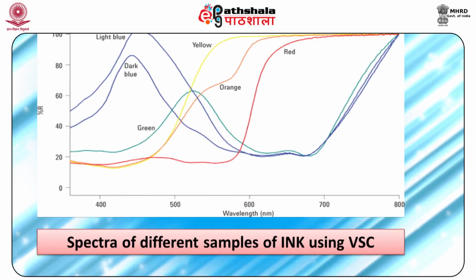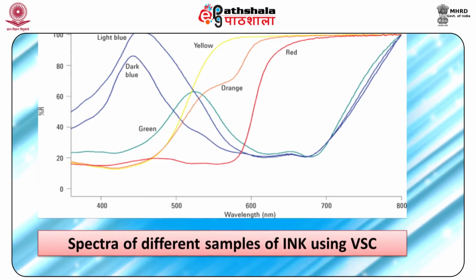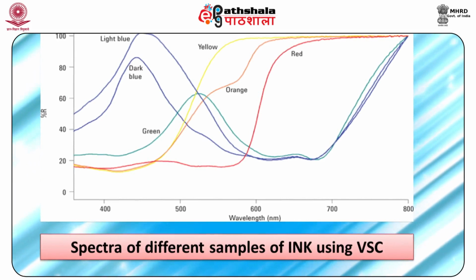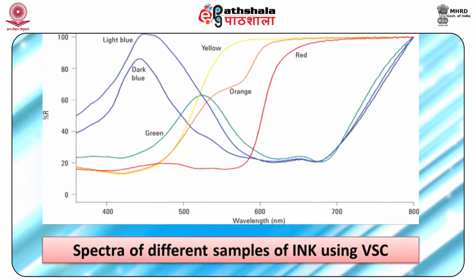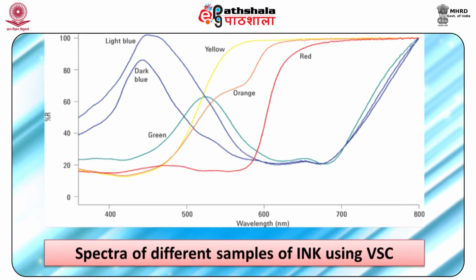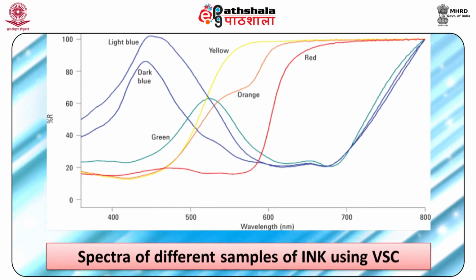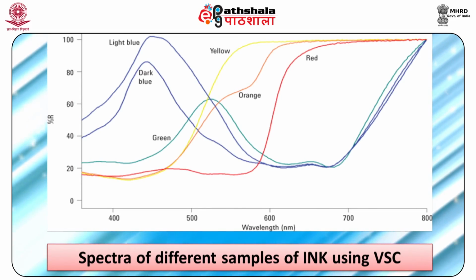While measuring the absorption of light, a white standard sample is used which fully reflects electromagnetic radiation of wavelengths from 400 to 1000 nanometers, and the comparison is done between the amount of light absorbed by the ink on paper and the absorption of light by the standard sample. For each sample of ink, absorption measurements are made and then the obtained spectra are averaged and arranged in pairs in order to compare them.